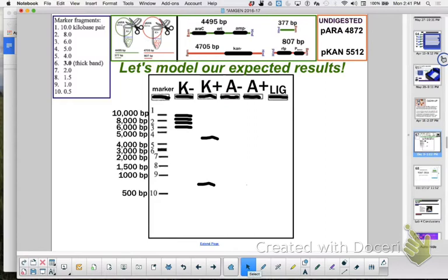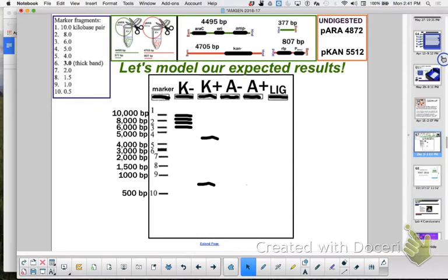So let's talk about why we did gel electrophoresis. One of the things we wanted to do is did we cut it? Did we cut it in the right place? And did we ligate? Did we form new combinations? Did we cut it? I'm going to compare K minus to K plus. It looks markedly different. And did I cut it in the right place? I'm going to take K plus and compare it to other fragment known sizes, the control, the marker.